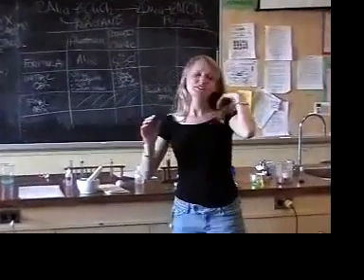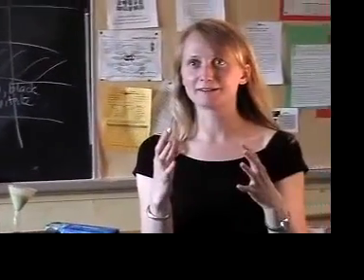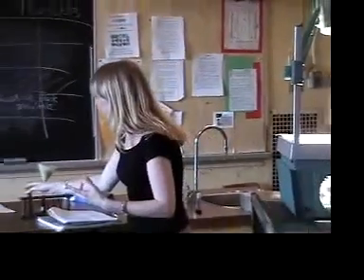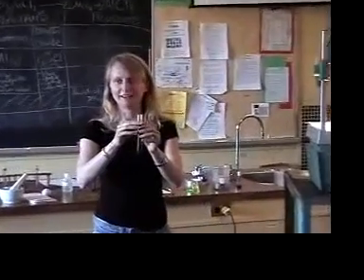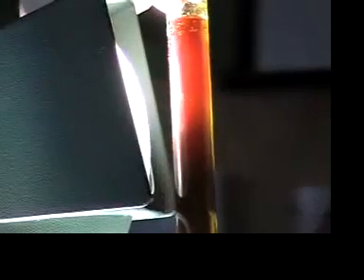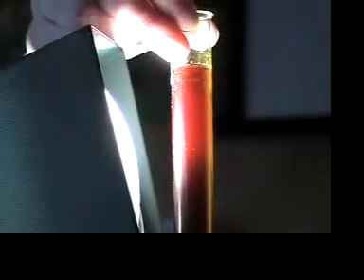All right. So the question is, now we've got chlorophyll outside of the chloroplast. It's not in the chloroplast. So what's actually happening? We said it looks green, so maybe we should take a closer look at it. Maybe we'll look at it under brighter light. Yeah, it's showing up nicely. It's very blood red. That's very cool. Can you see that at home?